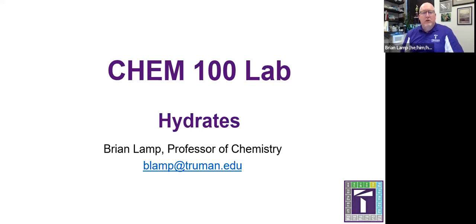Well, in this week's Chem 100 lab, we're going to explore an interesting class of compounds called hydrates. And this will be an experiment that actually gives us our first opportunity to do some quantitative analysis.